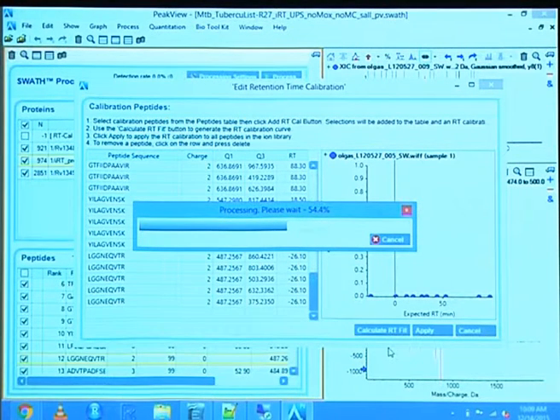One thing you can do with the retention time, with spike-in peptides as well as endogenous, is look at which ions work best and optimize them. Because in some cases you will see interferences, or if the peptide has a really broad peak, the retention time might vary from one file to the next, and that gives some variation to the retention time calibration.